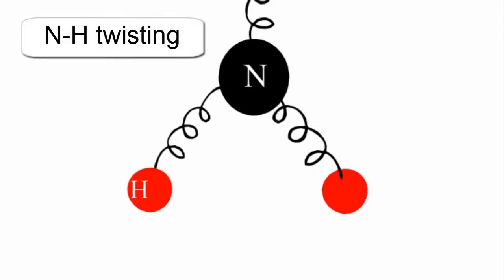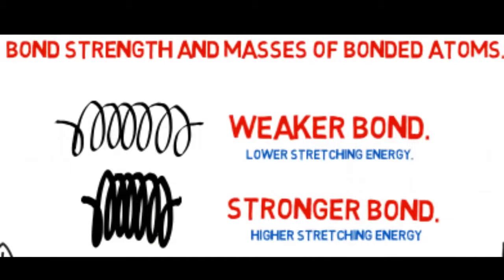And lastly, I'm trying to represent what's called twisting here. I'm not sure it shows it very well. But if you think of your two hands up in the air and you twist your body back and forth and how your hands would move, that's what you get.